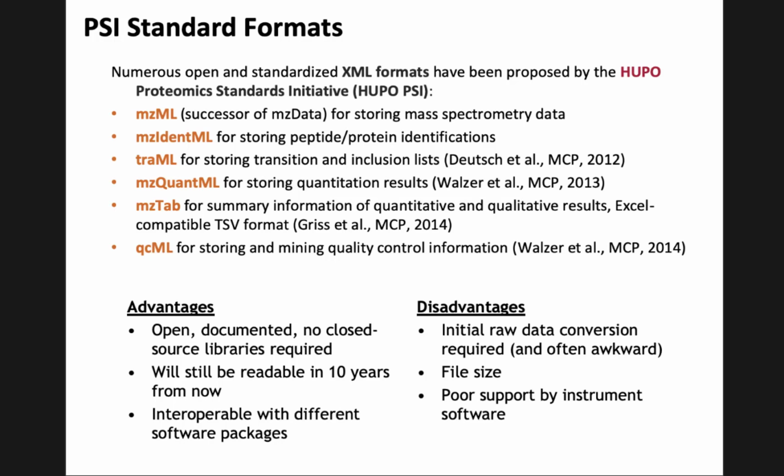And there are precedents where vendor formats could no longer be read after the company that produced the instruments went bankrupt, not in mass spectrometry, but related to that. And you can imagine what fun that is if you can't have access to your own data anymore.